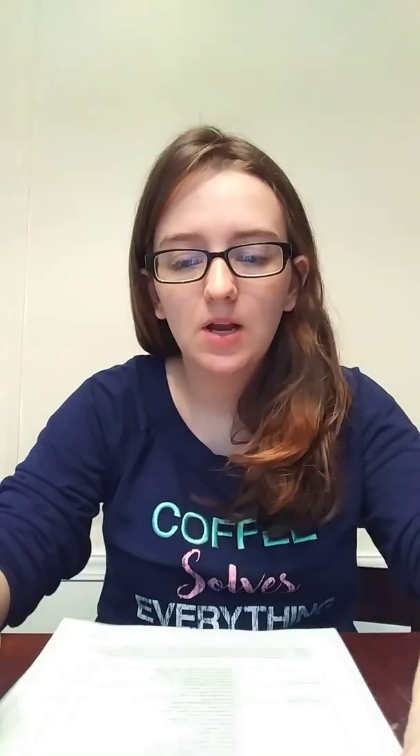It came in this pretty big box, from Carolina Distance Learning. If you look at their website, they sell all sorts of different lab sets. It's pretty cool — you can get them; it doesn't have to be through your school. If you're a science teacher or just into that sort of thing, they have all different ones. This is included in your WGU tuition for your chemistry class. It's a front and back page packing list, and I haven't really looked through everything. I figured I would go through it and do my packing list check-off to make sure I got everything, and share with you guys what was in it.